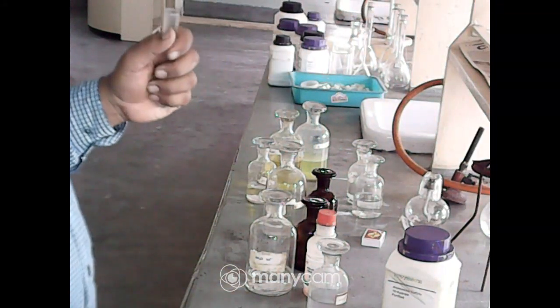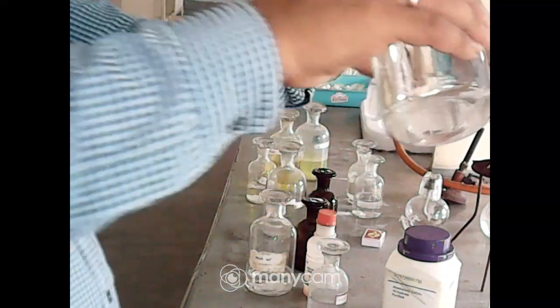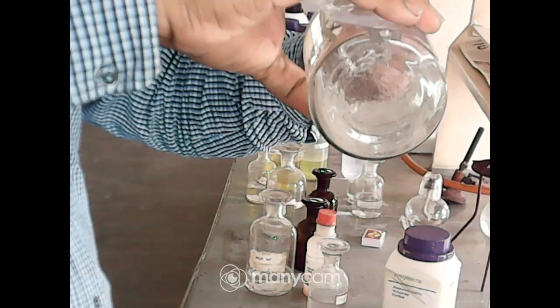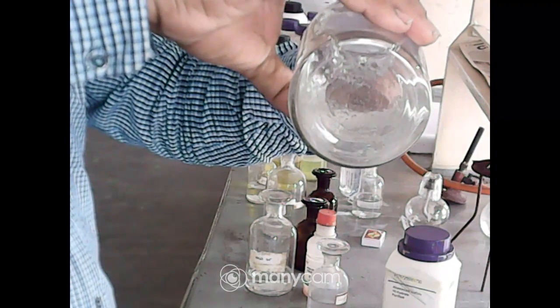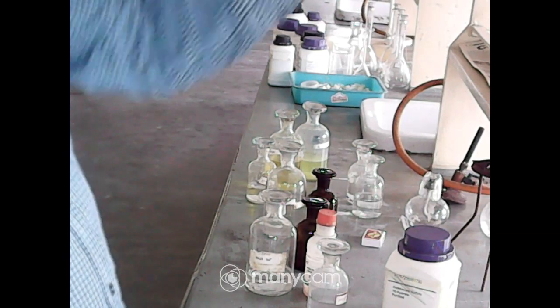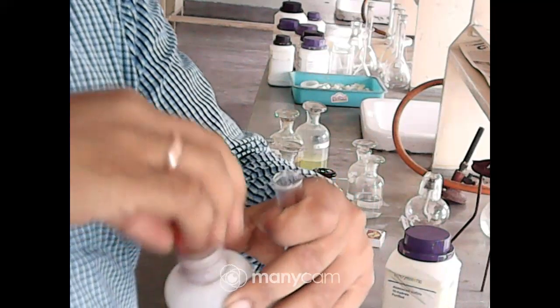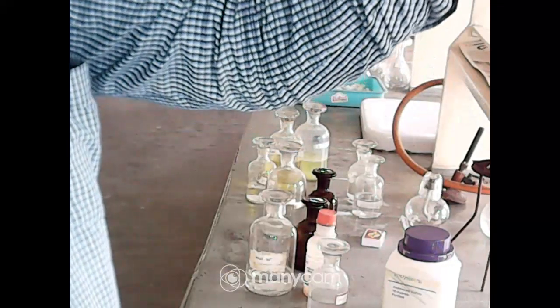Okay. You must use an apron. So for this, you will collect the apron previously. Okay, you can see that the PPT is totally dissolved. Now you have to add blue litmus because in basic medium it responds. So add blue litmus, it will turn to red color because the medium is acidic now. A light red color is there.